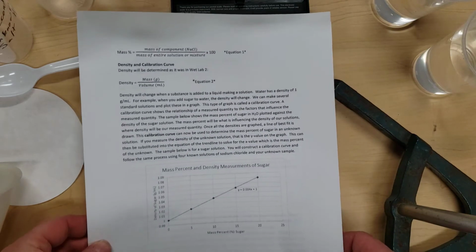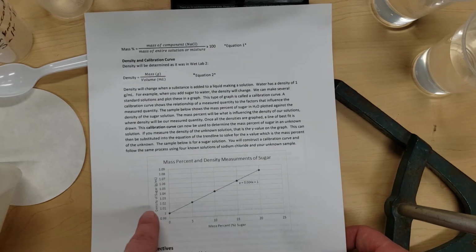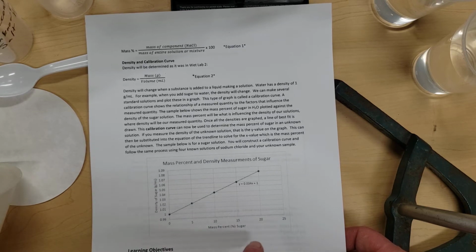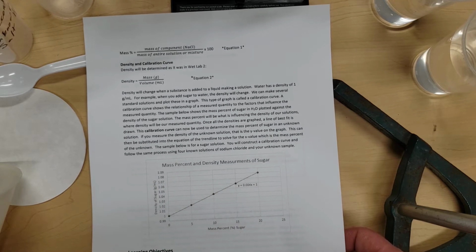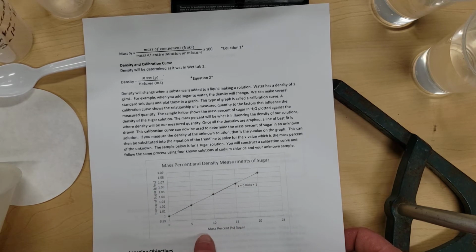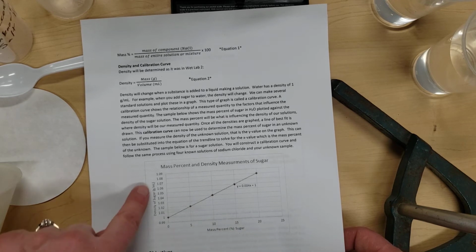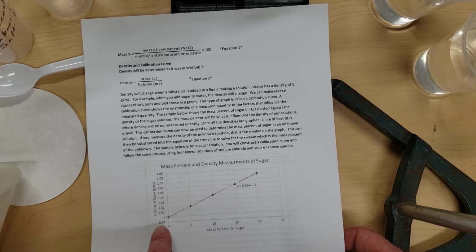a calibration curve. So a calibration curve, we can plot one quantity and a second quantity and see the relationship between them. So in this lab, we're going to plot the mass percent of our salt versus the density of our salt to find a linear relationship between the two.